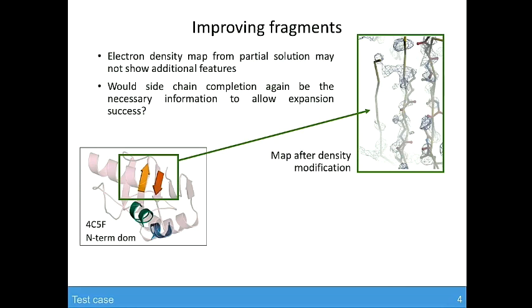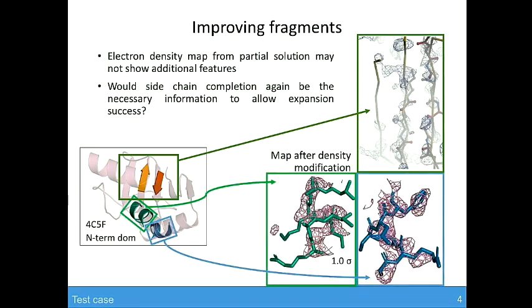And if we look at those fragments of the α-helices, here we only had the polyala chain, and these sticks are the final structure. Even when we lower the sigma, we do not see a strong signal for, for example, the side chains. We only see the signal for the electron density for the main chain.